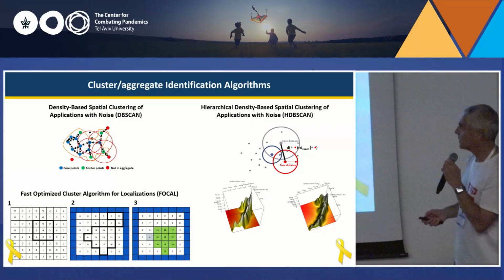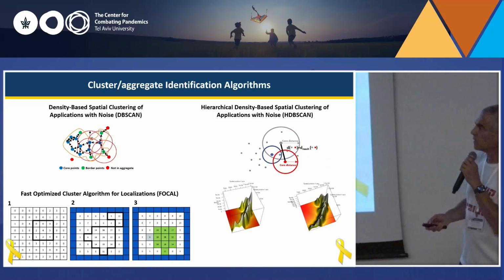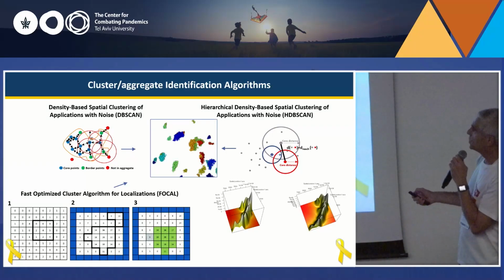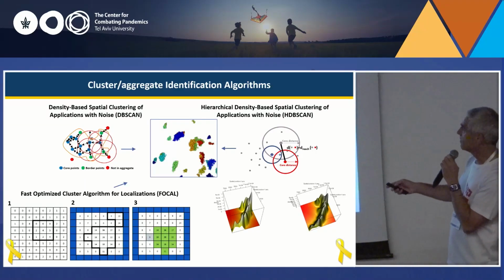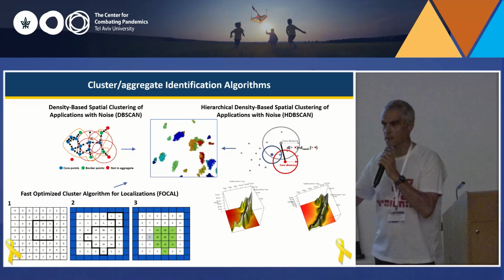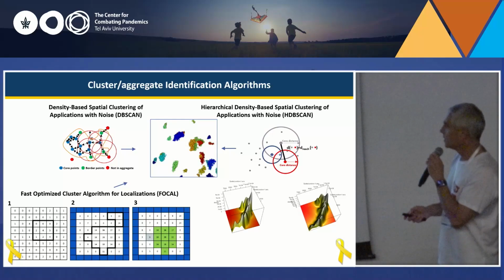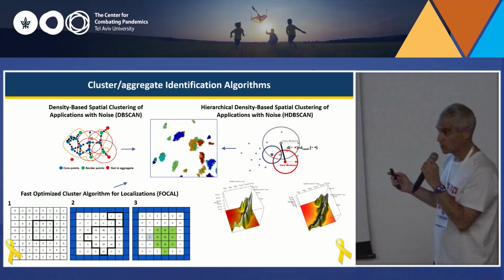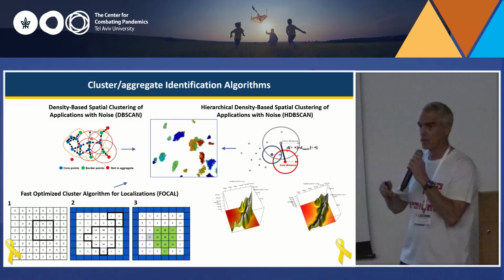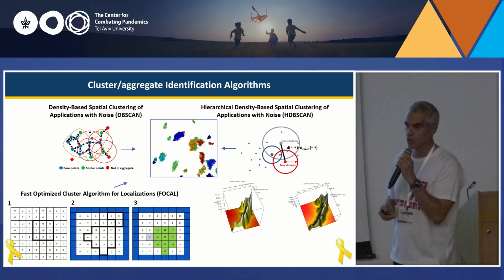So we are developing, Ophir in my lab has developed a lot of cluster analysis algorithms. At the end, she wanted to be able to say that this aggregate has X molecules and the density is Y and the size is F, and then we can compare between different conditions. So this is the system, so we can practically check aggregation outside the brain.